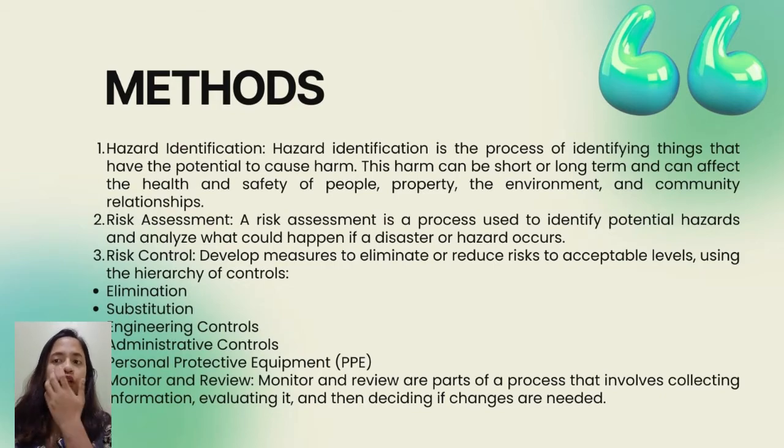For hazard identification, this is the process of identifying the things that have the potential to cause harm. This harm can be short or long term and can affect our health and safety, property, the environment, and also community relationships.